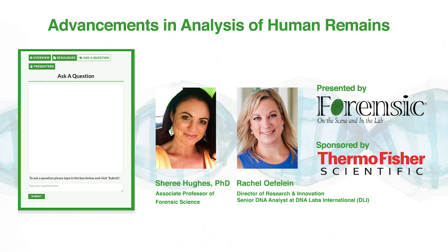Okay. Now, how do you prepare teeth for analysis? For teeth, if it's going the rapid route, we'll simply crush the tooth and remove any enamel, and then the remainder of the tooth is going to go into that rapid cartridge. If it's not going for rapid and we're going to go demineralization, then we'll still crush it and remove the enamel, but then it's going to go through the mixer mill and get powdered to a fine powder prior to extraction.